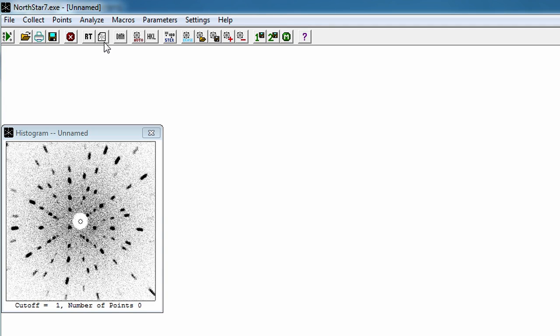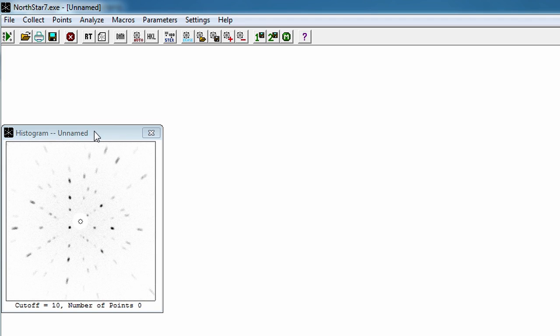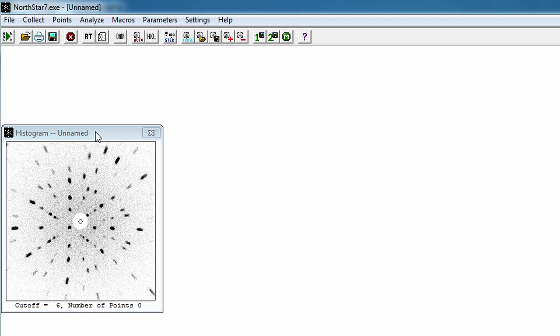As you can see, collecting data over time gives a much higher precision measurement than the real-time image. You can see many spots clearly illuminated. We can also take this image and look at it with different cutoff levels, which, as you can see, reduce the background. If you cut off too high, some of the points become faint as well. We will use a value in the middle.